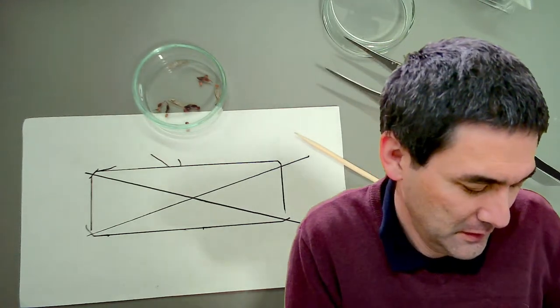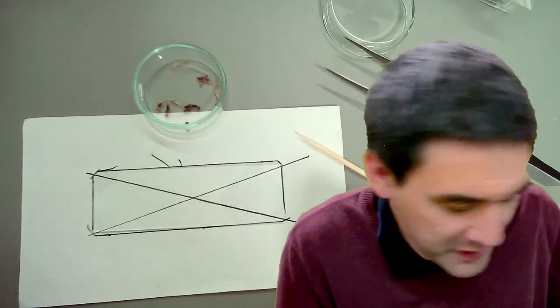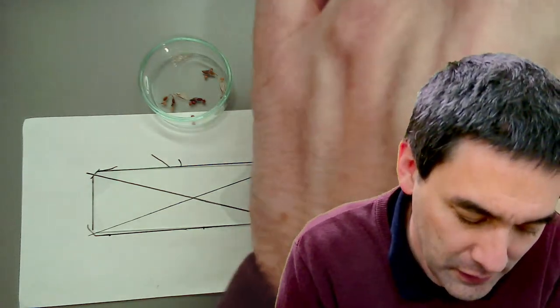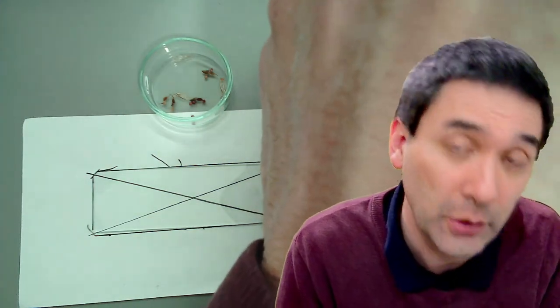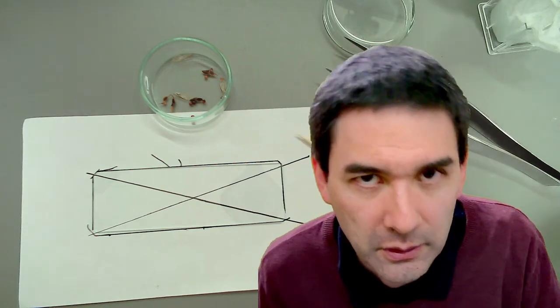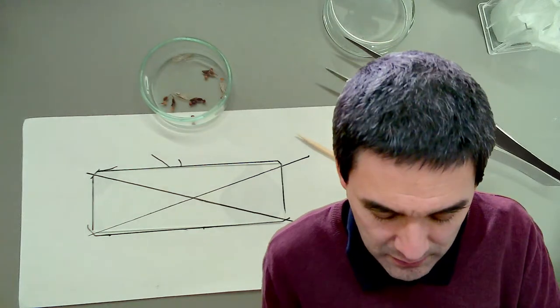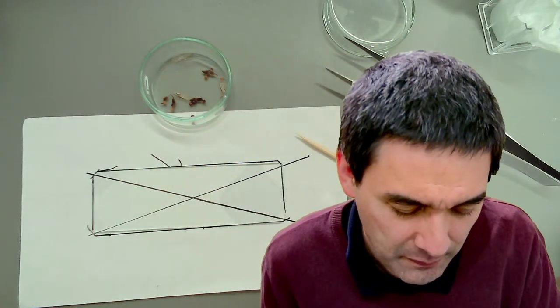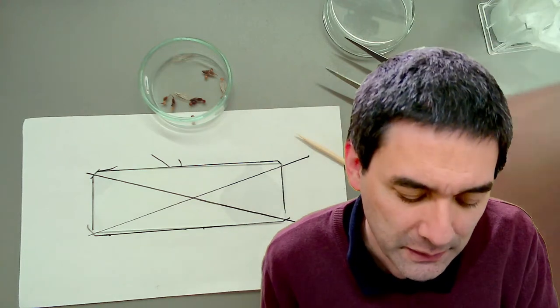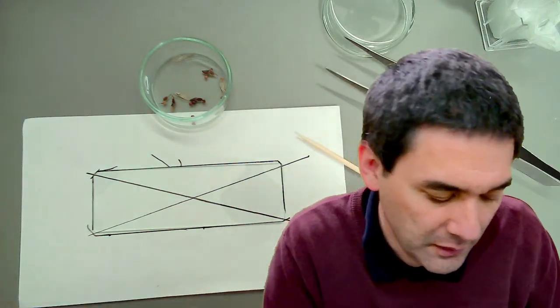Okay. So should you use round or square cover glasses, because there's a question? No, that's cool. I only have square ones. Honestly, if you have square ones, just use square ones. They're cheaper, and maybe, I don't know, that's probably more theoretical. Maybe the round ones, besides looking nice, have a larger area compared to the volume, so I think the mounting medium might evaporate a little bit faster because there's simply more place for the solvent to evaporate.